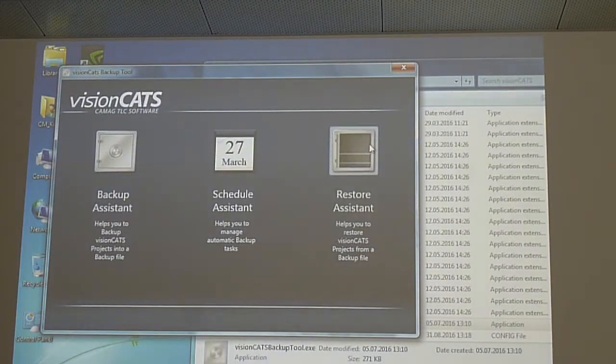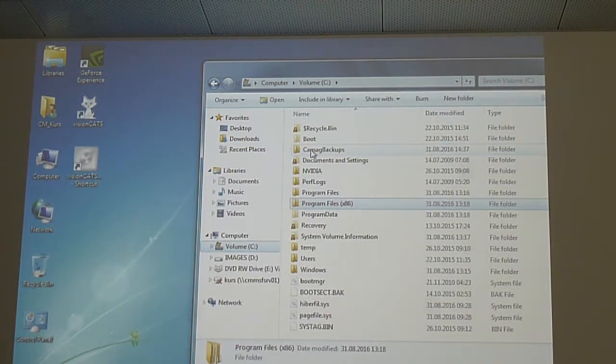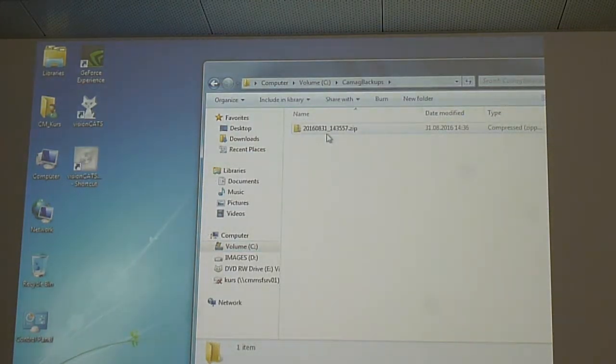And here, we will see later on, this is about restore. We just did a backup, so we did the backup now and we checked. And with that we can do a restore. We will see later on. So just to quickly go to the backups, here you see now this zip file.